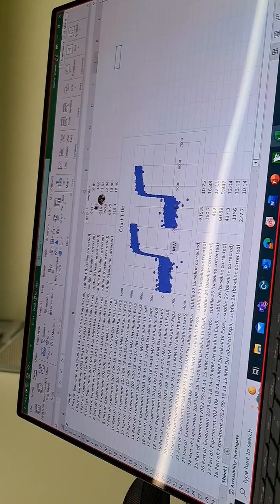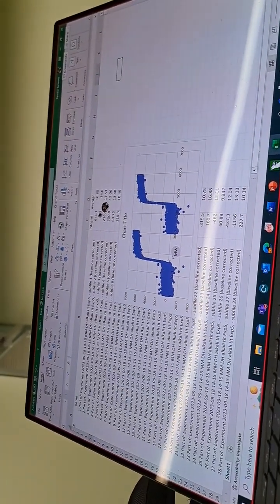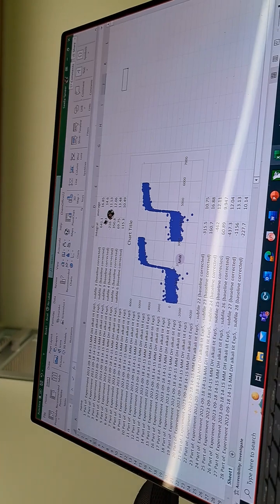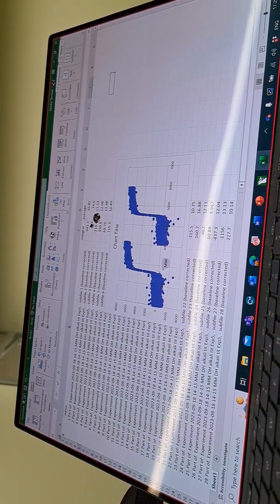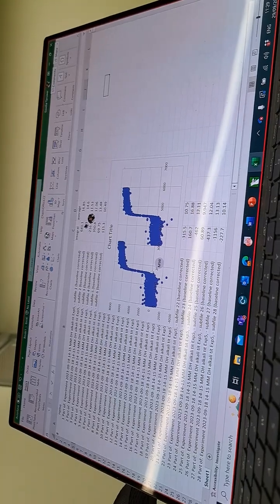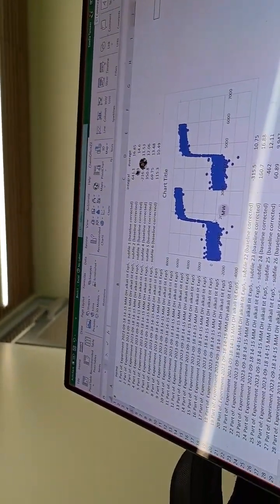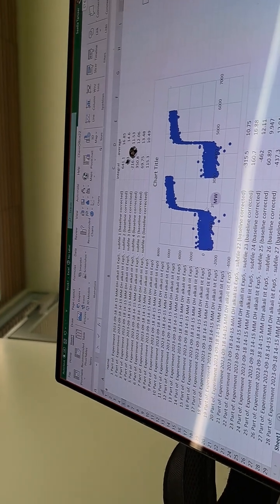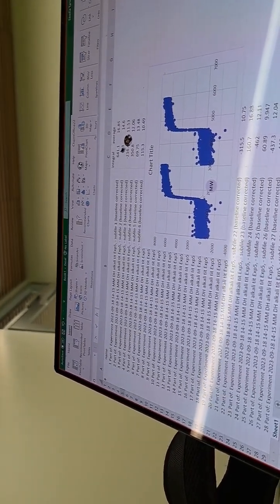I will do this. Once you've done that, you can generate the graphs. Okay, fine. The other point was to stack all and see how the areas move as a function of time.